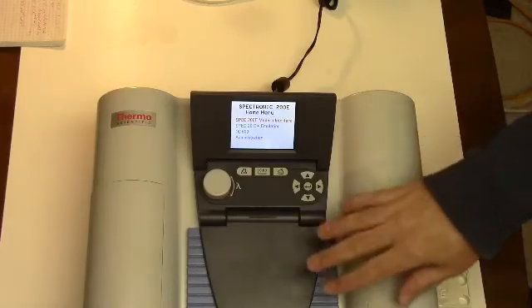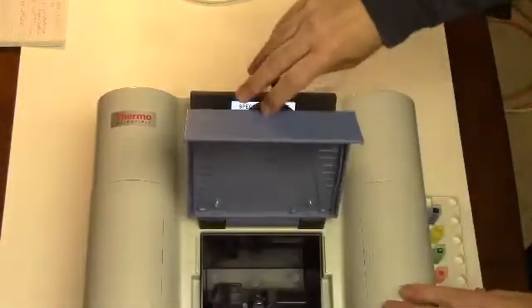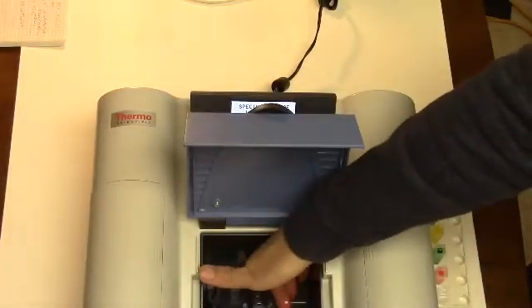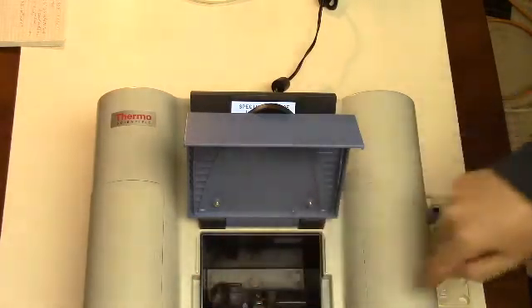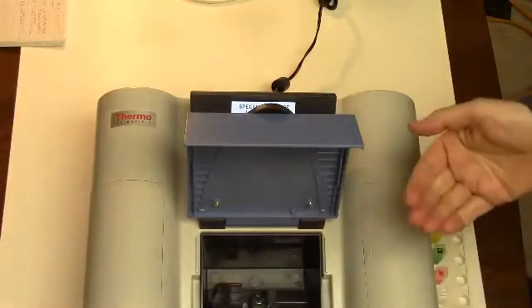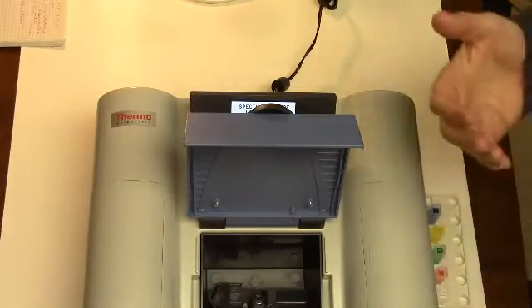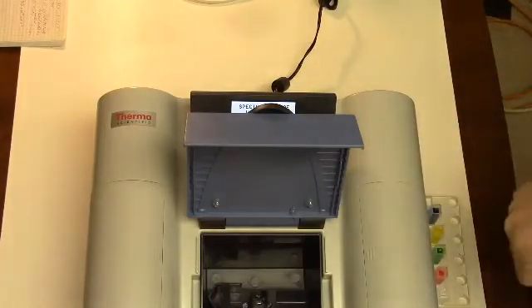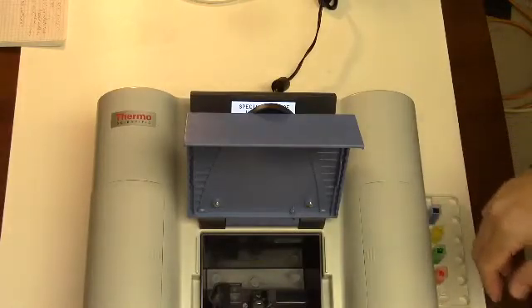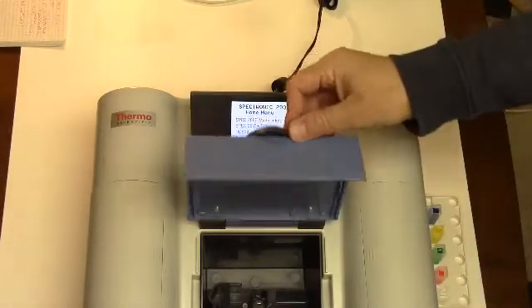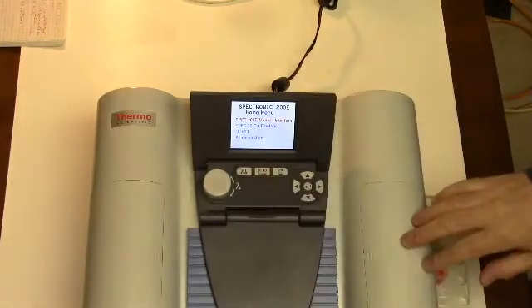So it's a pretty simple instrument. The way it works, if we open up the compartment here, there is a light source down in here, you can see that hitting my finger, that passes a light beam across here. You'll put your sample in there, some of that light in the visible spectrum or the ultraviolet gets absorbed, and the detector on this side then detects which wavelengths of light are being absorbed. That's just an oversimplified version of how this particular instrument works.